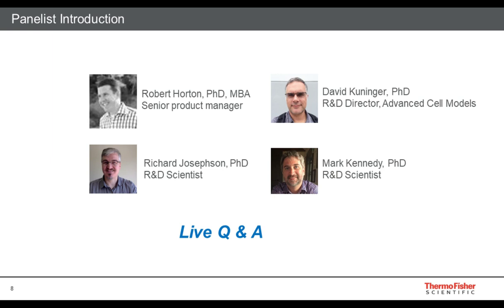Right. Yeah, I'm going to go back a little further than that even. When I started working in 3D models, I thought it would be easy. Just take my cells growing in 2D, dissociate them, plate them in suspension, and voila. But it was not. We were initially trying to generate spheroids in agitated culture plates, and I had to learn the hard way that you have to set your speed very carefully, and control your media volume so that all your cells don't float to the center of the well and aggregate.